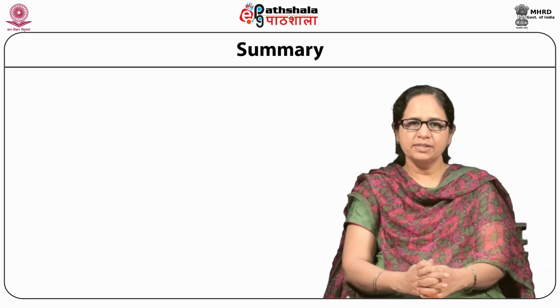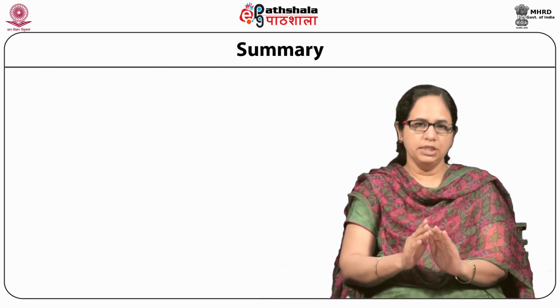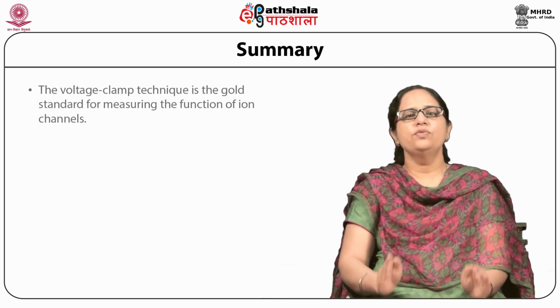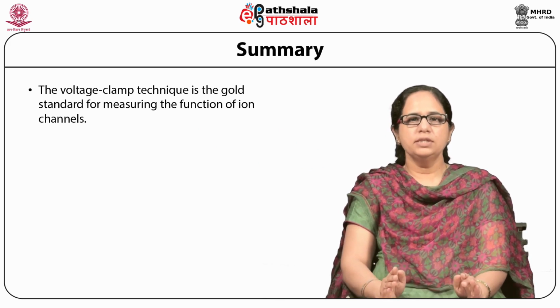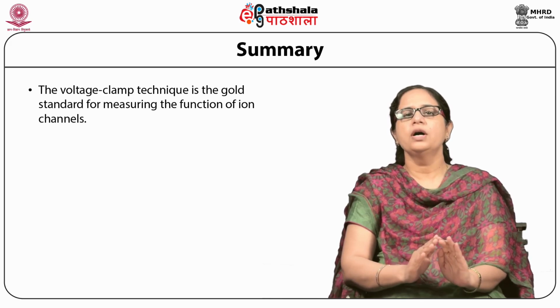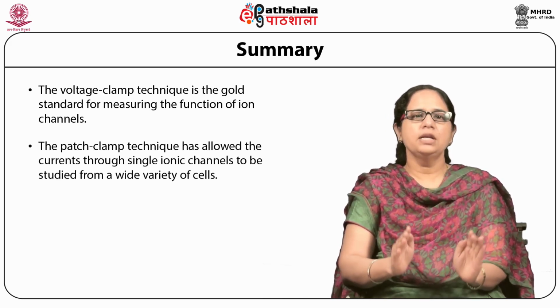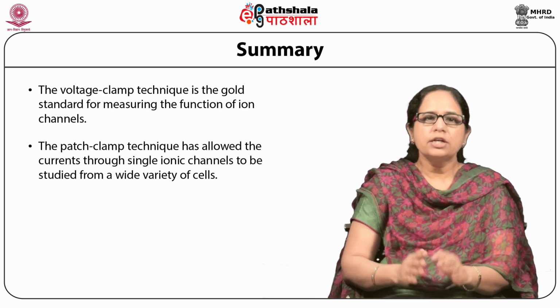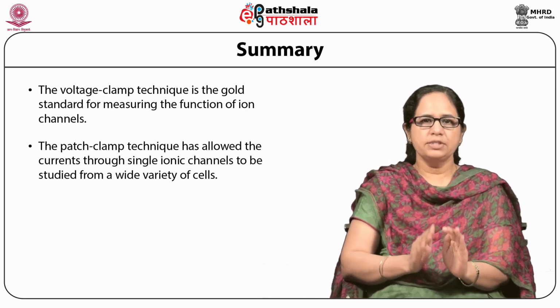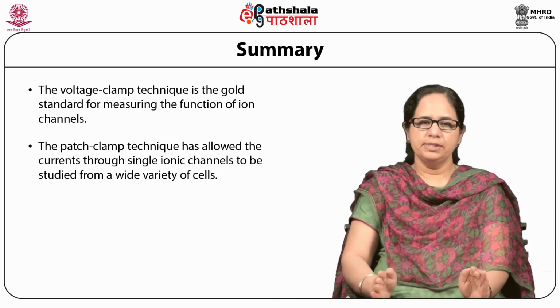So, students, let us now summarize what we have learned in this module. The voltage clamp technique is the gold standard for measuring the function of ion channels, and the patch clamp technique has allowed the currents through single ionic channels to be studied from a wide variety of cells.